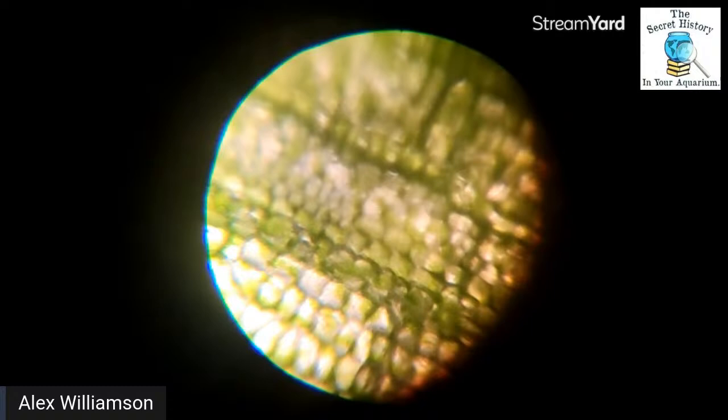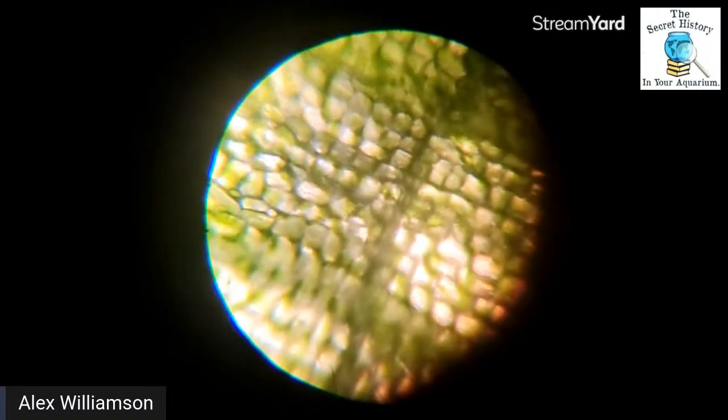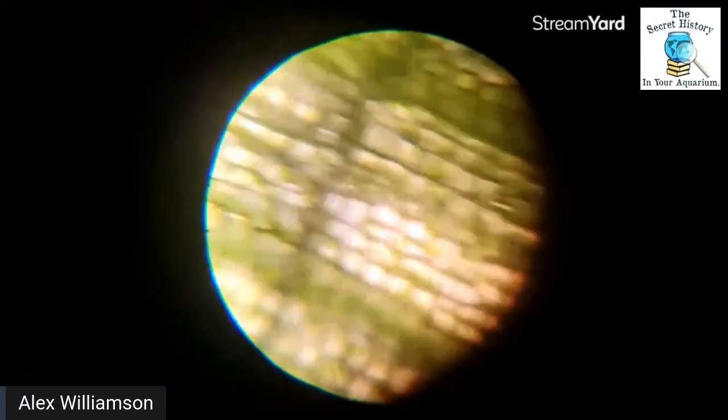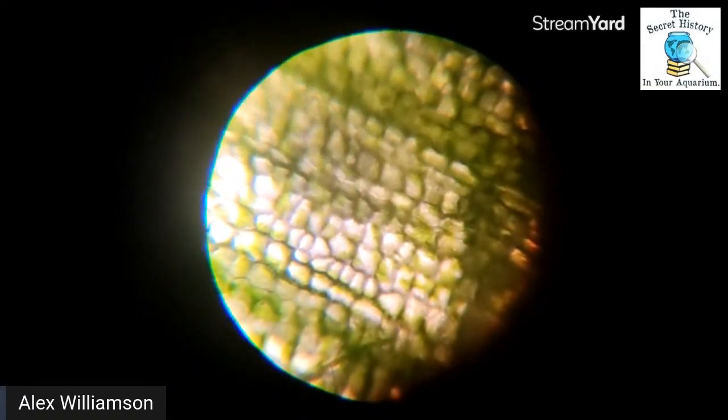And that's where all the DNA is. That's how we would clone it. If we needed to, we would extract it from there. That's why I'm bummed that I can't zoom in 400 times for you guys to show you all of this. And we'd need dyes, actually. Methylene blue works okay, but really we'd want some better dyes. Maybe I'll save up and get some.